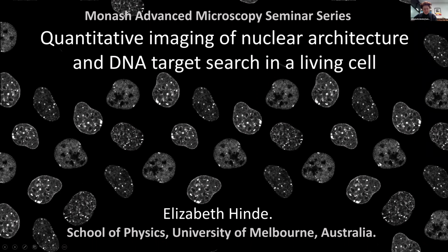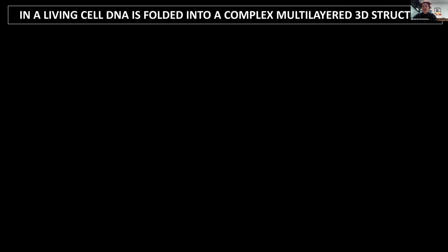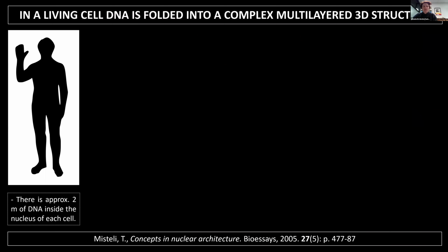So thank you to Sentil for the opportunity to speak in this series. Today I'm going to talk about quantitative imaging of nuclear architecture and DNA target search in a living cell.